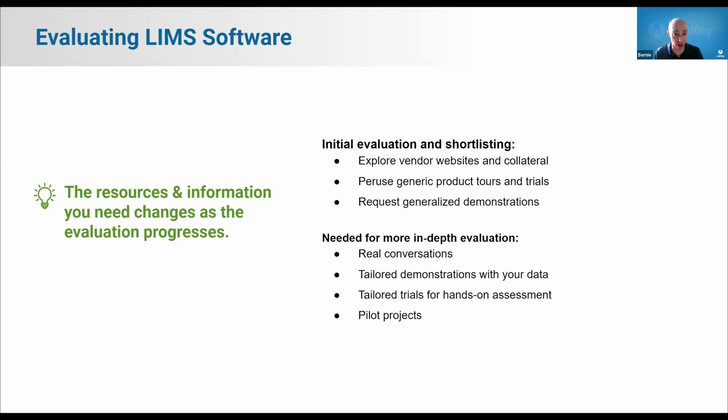I will also call your attention to the conspicuous lack of a pricing assessment in these early stages. This is because most LIMS vendors will not publish their pricing. This can be very frustrating, but do not be afraid to ask directly for pricing. Simply be ready to answer a lot of the questions that I have prepared you for earlier in order to get an answer.